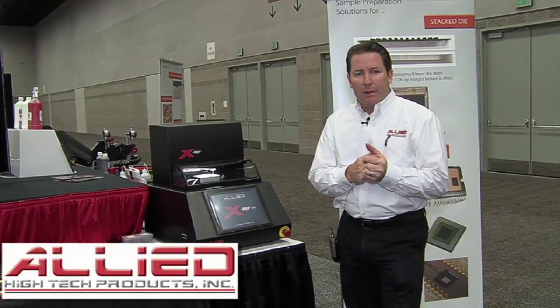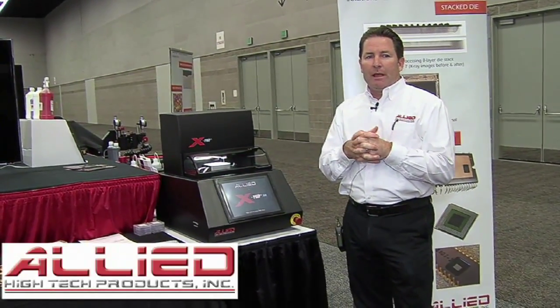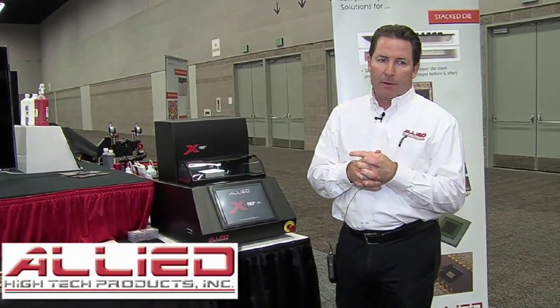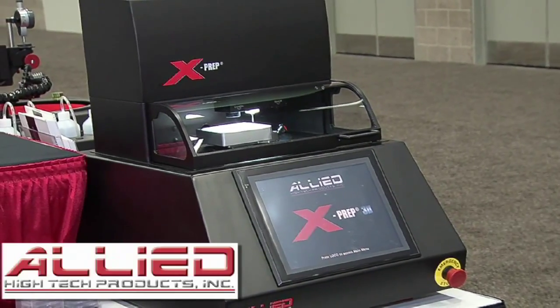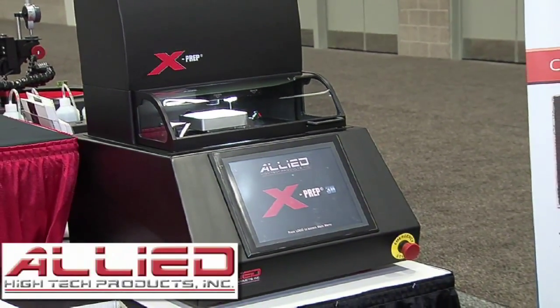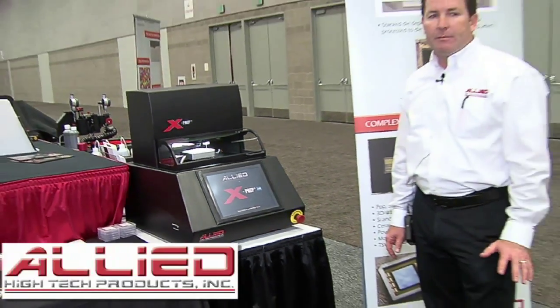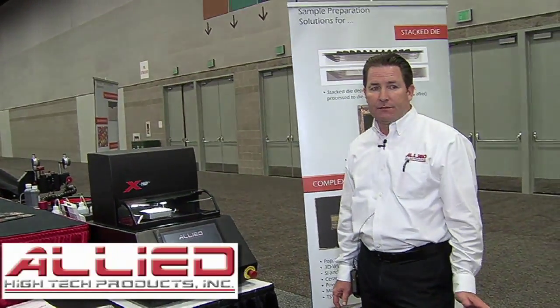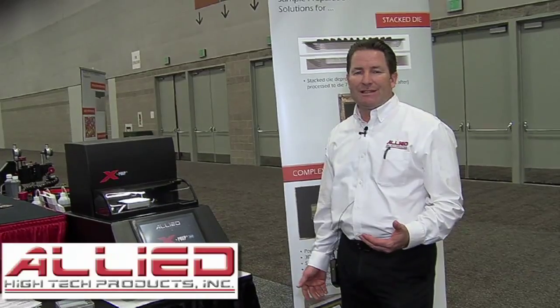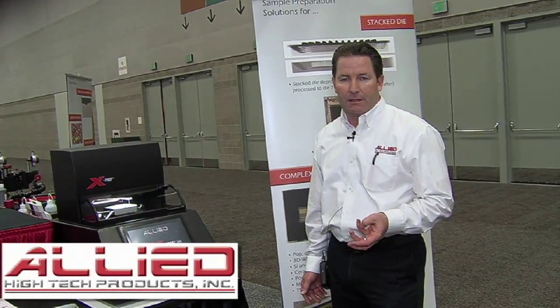As in the past few years, we're again showcasing our X-PREP and sharing with you its virtues that we believe make it one of the most capable state-of-the-art sample preparation tools on the market. First introduced at the conference here in Portland in 2008, the X-PREP was designed to be the finest and most capable sample preparation tool, built on a common CNC machine technology with five axes of control, engineered and designed for both deconstruction of semiconductor devices for physical and electrical failure analysis.